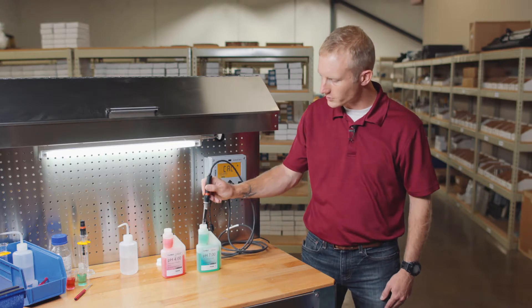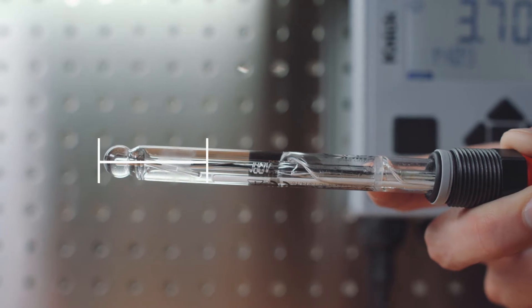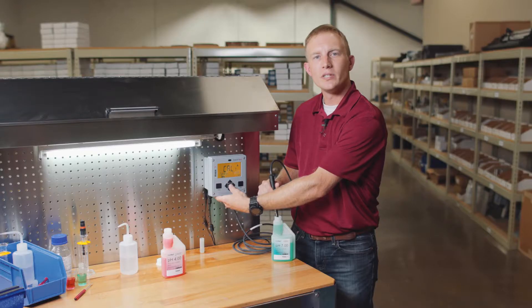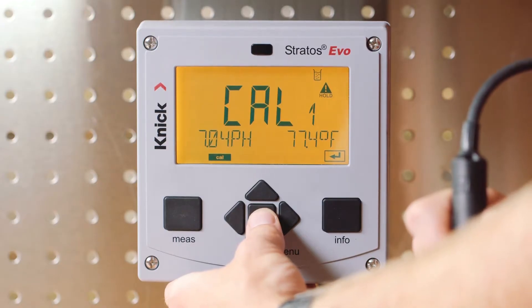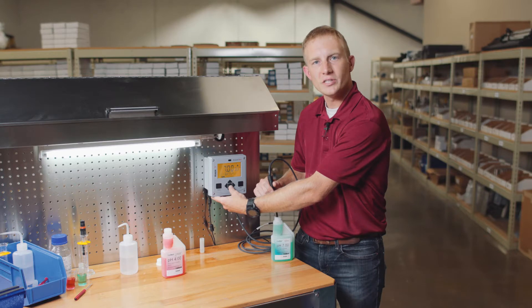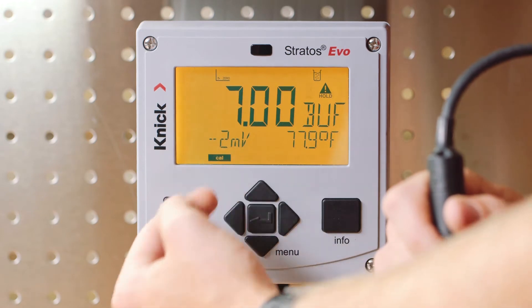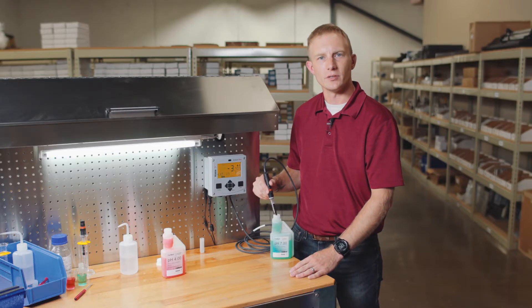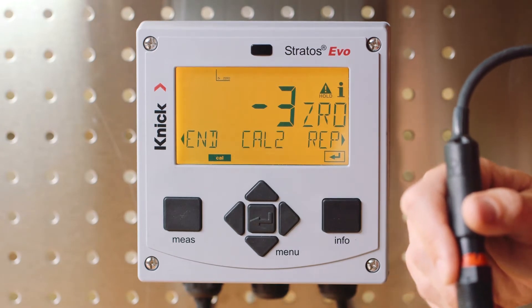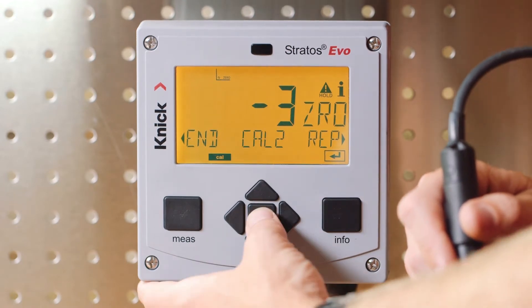Let's place our sensor in the first buffer solution and stir lightly. We want to ensure that the entire pH measuring bulb, along with the sensor's junction, are fully immersed in the buffer. We want to ensure that both the pH value and the temperature value at the bottom of the screen are stabilized. In automatic calibration mode, the transmitter will display the recognized buffer value as well as the millivolt value. Once completed in the first buffer solution, the zero point of our sensor is displayed and the Stratas Evo now prompts us to move to the second step in the calibration process. We'll press enter to continue.